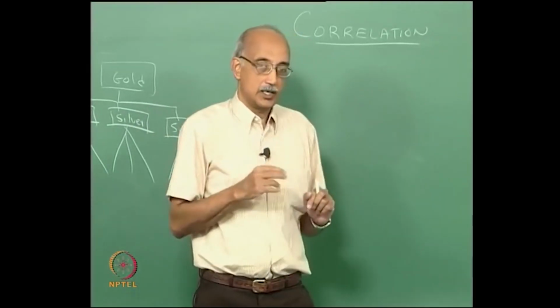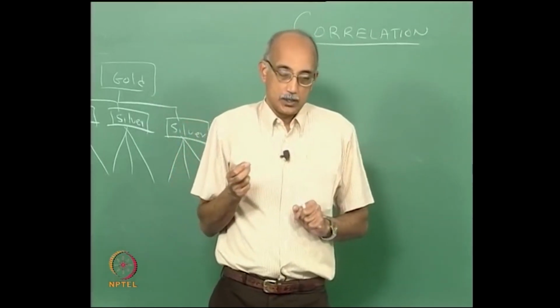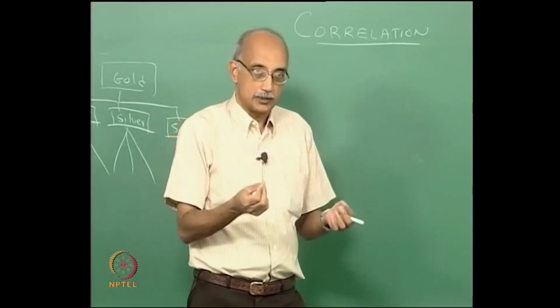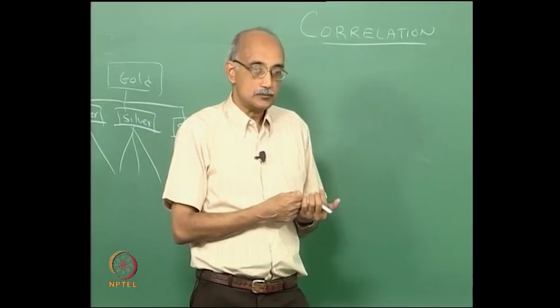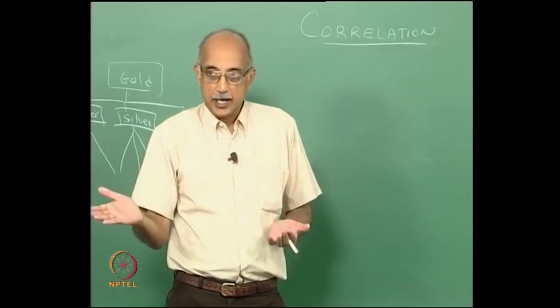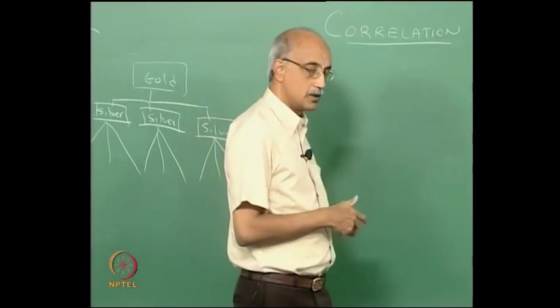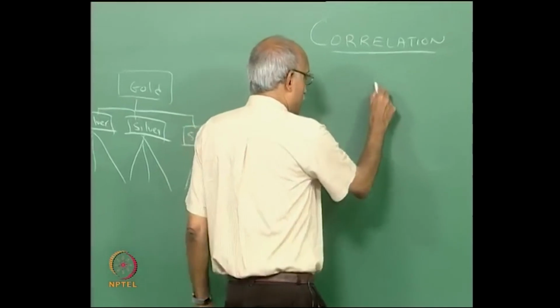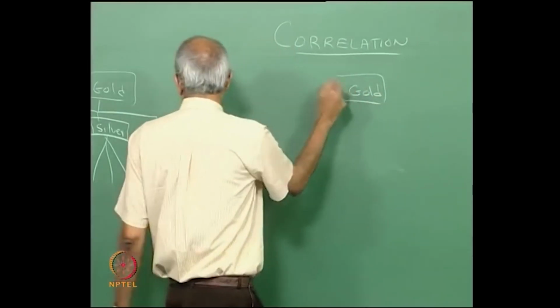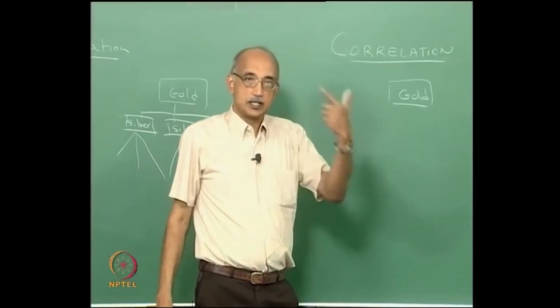But correlation kind of completes the exercise by ensuring that the process that is being used to produce the data by analyzing the sample is also identical across various labs, across various manufacturing facilities and so on. So, in correlation also you will typically have a gold standard, but this gold will be different from this gold in the sense that it is not just an equipment, it is actually the entire process.